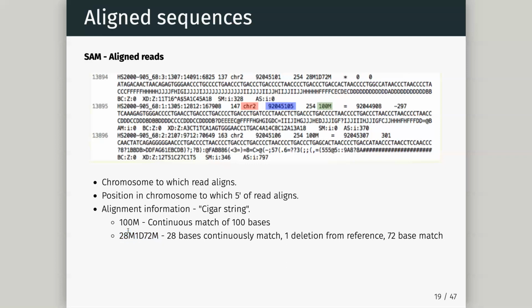We're not going to go through these files one read at a time, but the computer will go and read this SAM file, and that's how we build visualization of BAM files for things like IGV. It's also how we find splice junctions, because there we'll have map, and then we'll have a gap, and we'll have more.